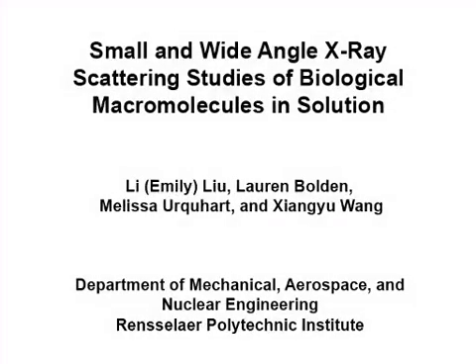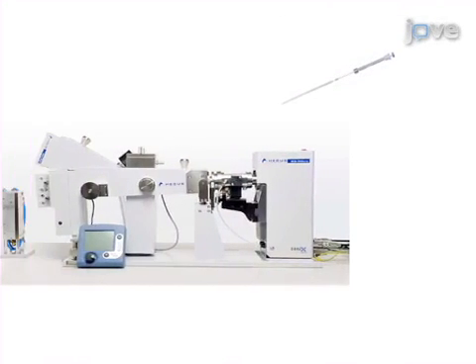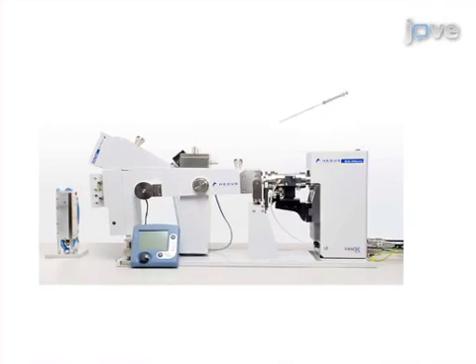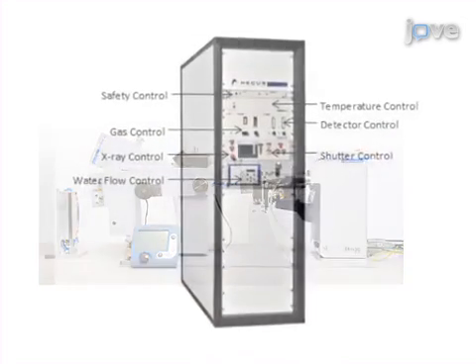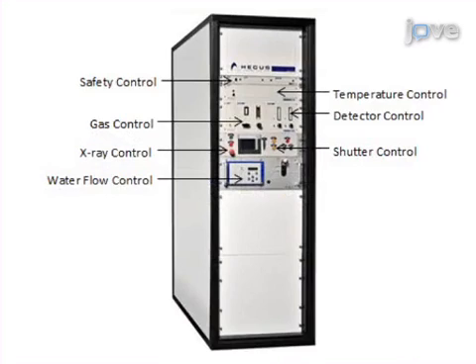The overall goal of this procedure is to determine and analyze structural changes of nanoparticle samples. This is accomplished by first preparing the sample in the capillary and placing it properly into the system. The second step is to calibrate the detectors for optimal efficiency, power on the x-ray system, and ensure a proper vacuum is maintained.